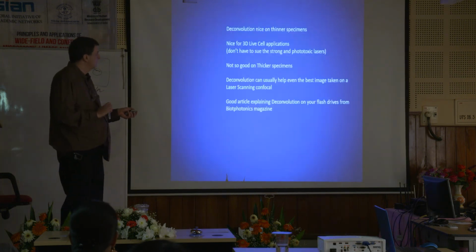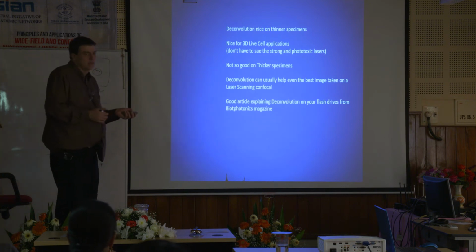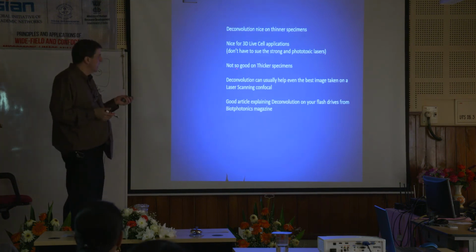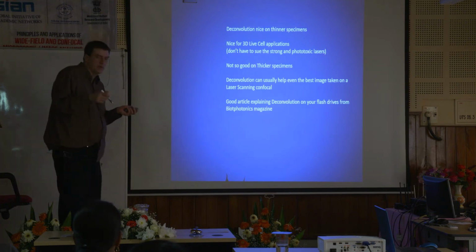Okay. So I like it on thinner specimens. A lot of times in my lab, I'll just do it on cells, because cells are thin, and I don't want to go over to confocal. The user doesn't want to spend the money, which I don't blame them. And it's trouble on thicker specimens. It's the kind of thing you almost have to run it to see if it's going to work.